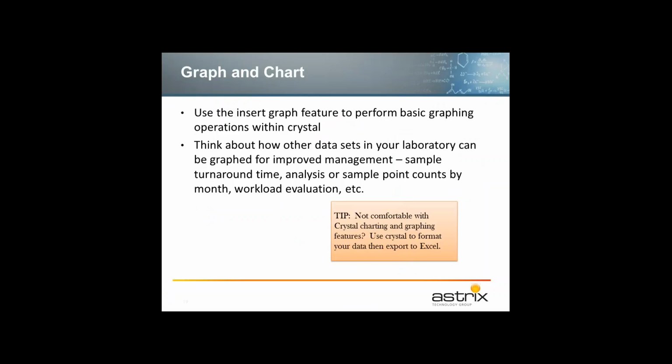So in summary on this one, use this insert graph feature to perform basic graphing operations within Crystal. Think about how other data sets in your laboratory can be graphed for improved management. Maybe you want to graph things by sample turnaround time, or maybe how many analyses you did on this sample point during this month. Workload evaluation, how many analyses this particular group is doing versus this particular group. So there are a lot of managerial implications as it relates to the Crystal charting feature.